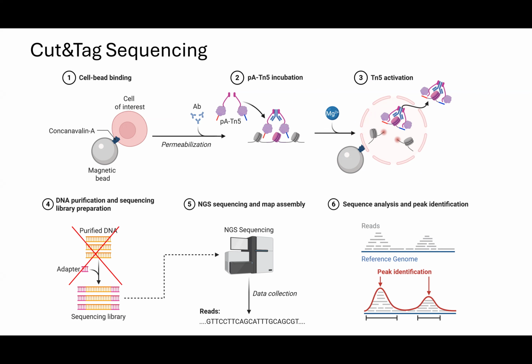So it cuts the DNA and adds the sequencing adapter at the same time. And that's what you don't use. Yes. Yeah, I think they do both cut and run and cut and tag, but yes. And then a lot of the other newer technologies are with tagmentation in general. And one big advantage of cut and tag again is it has a single cell ability. You can't really do cut and run in a single cell way because you have the DNA coming out of the cells during the process. This you can do in a single cell droplet. So I guess I'll get to the next one.